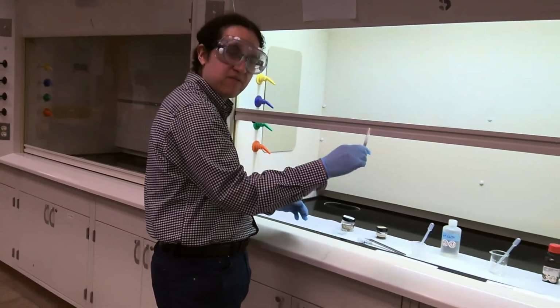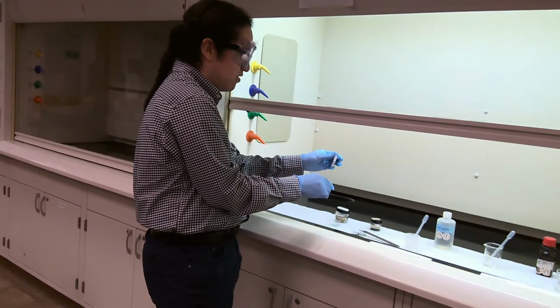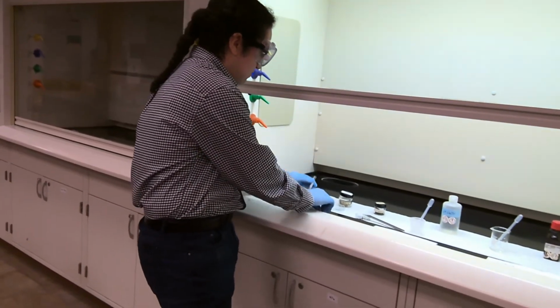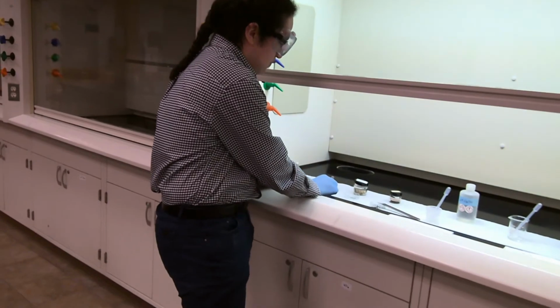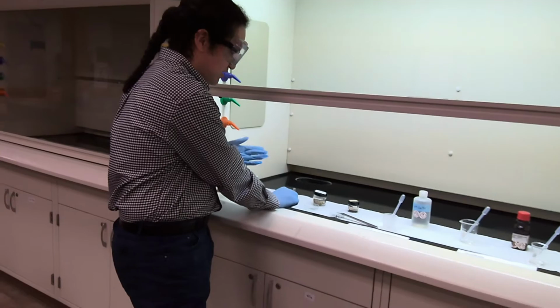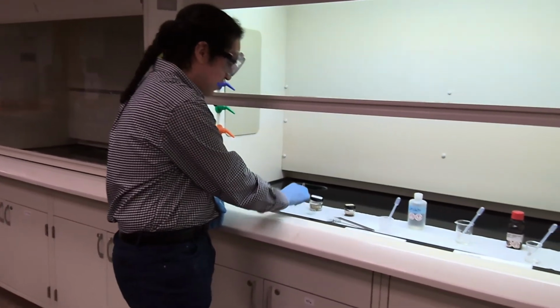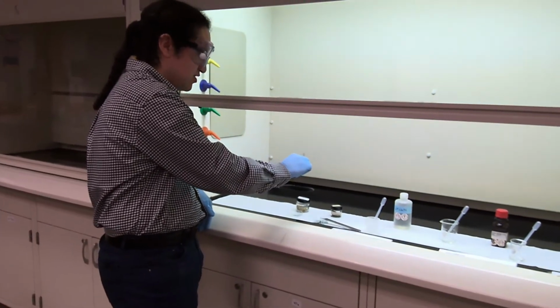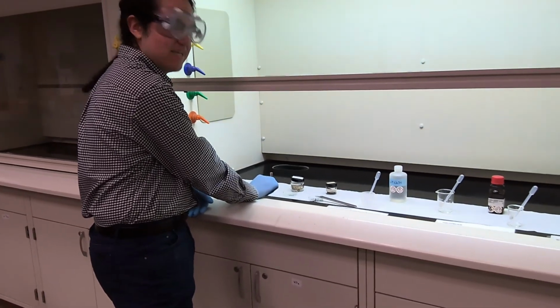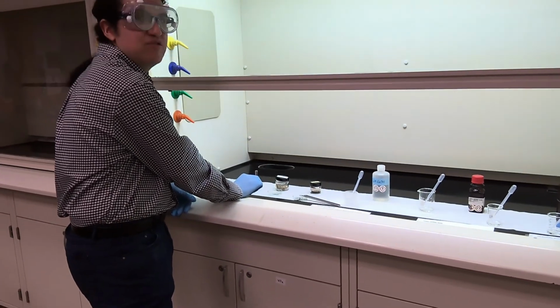So as you can see, even from over there, there's vigorous generation of bubbles and heat. Again, you always keep things pointed away from you when you're handling a test tube. Quite an exothermic reaction. That's why I switched to holding it with something other than my bare hands. And I'll bring it close to the camera so you can see, but our magnesium strip has certainly disappeared, and we now observe generation of a new solid.